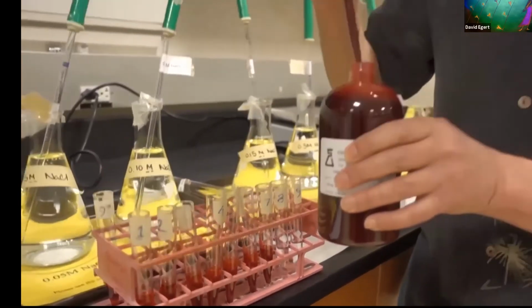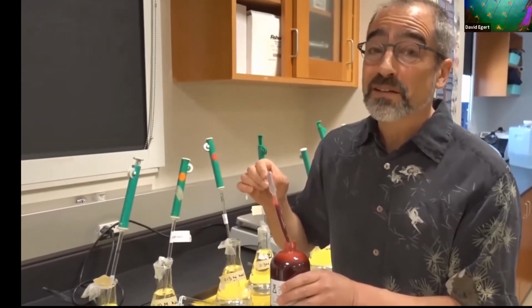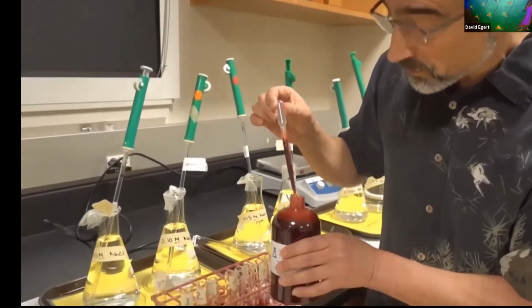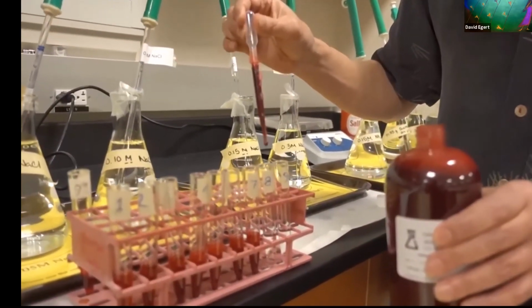Notice I'm also refilling before it's empty so I don't get into a weird position where I've done part of the drops and get foam coming out and then it's not a well-formed drop. So I'm trying to preemptively make sure I get 6 well-formed drops.